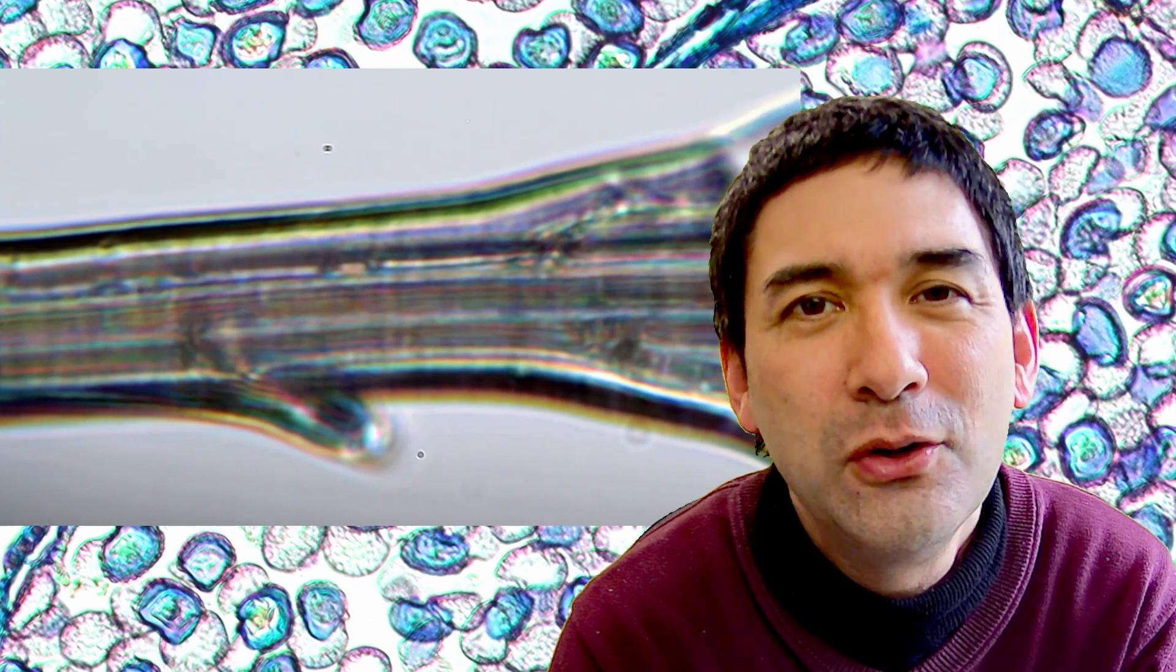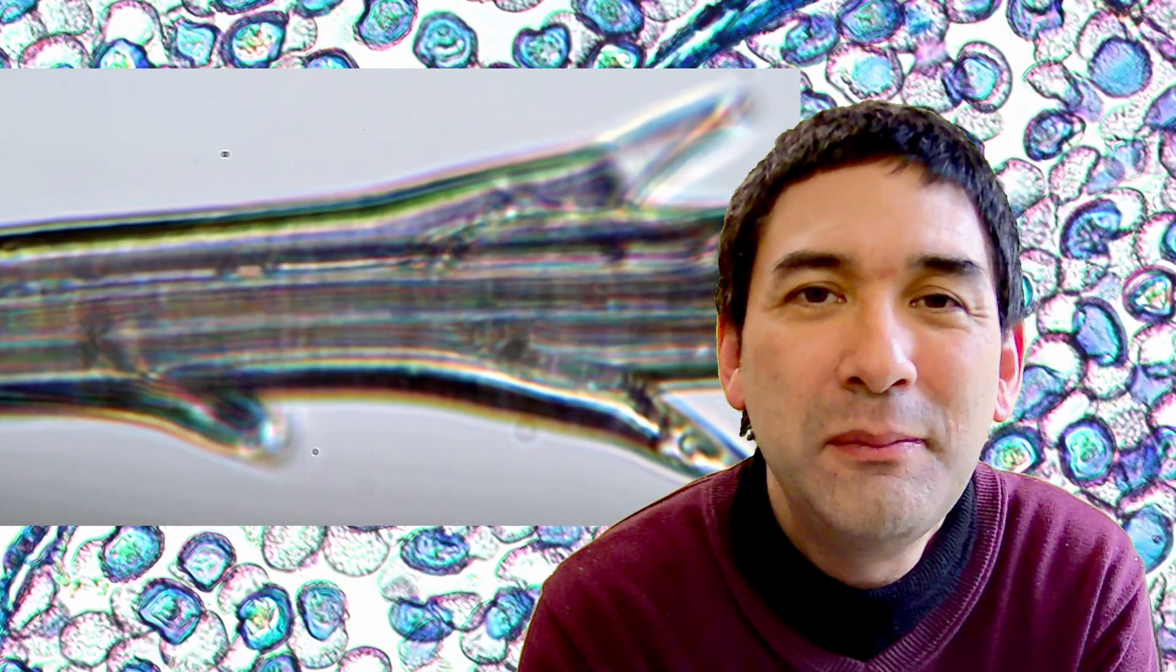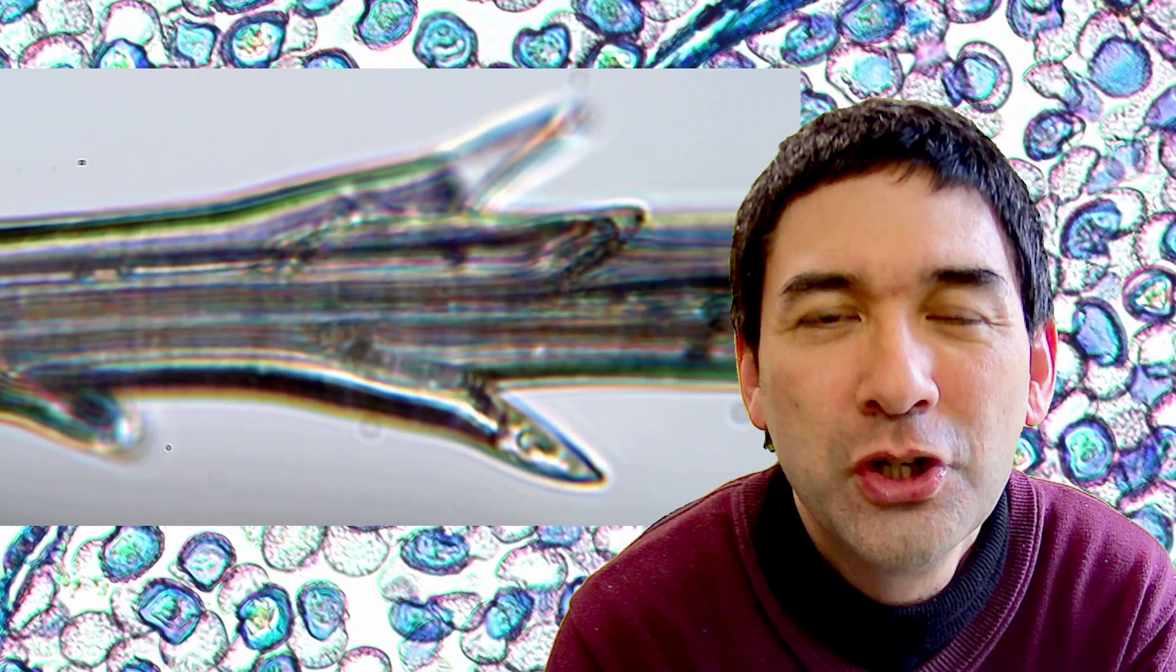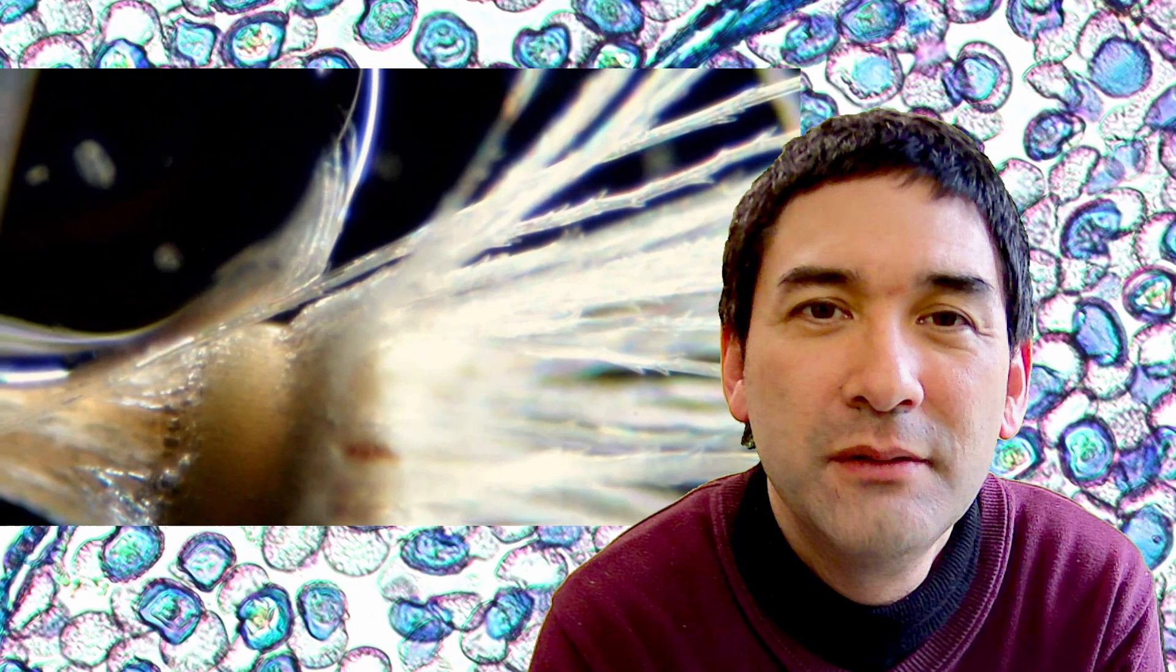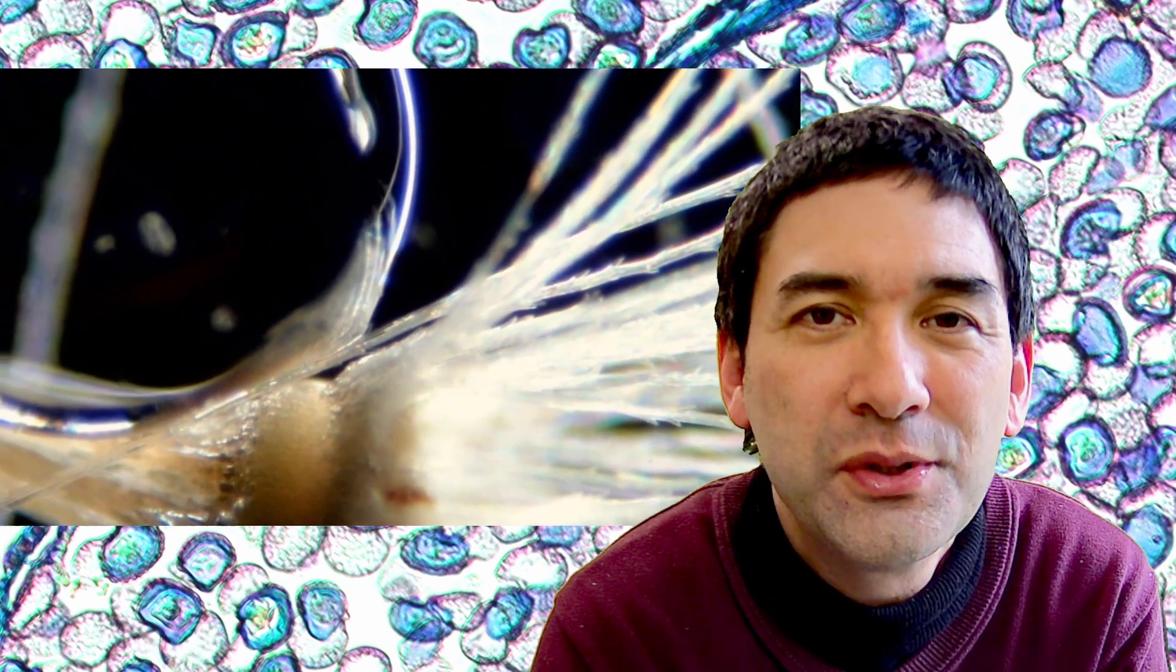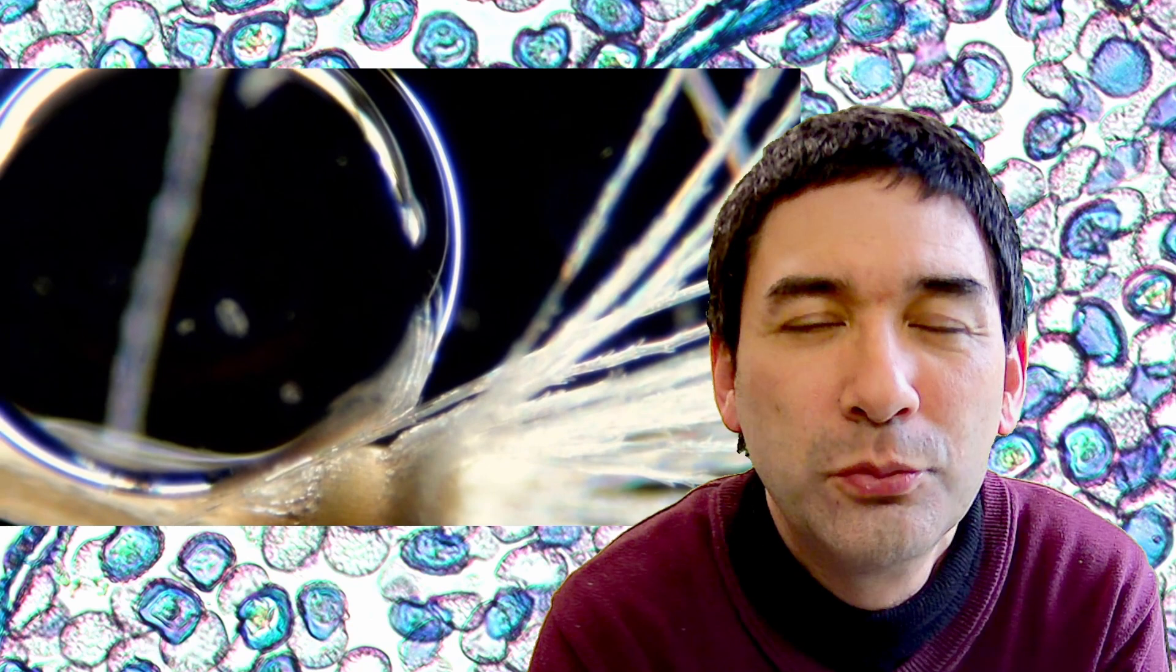Here, this is way beyond the resolution limit of my microscope—shouldn't have zoomed in that much because you can see the diffraction patterns. This here must be in dark field. The structures are a bit too bright. I think I used the auto exposure setting of my camera.